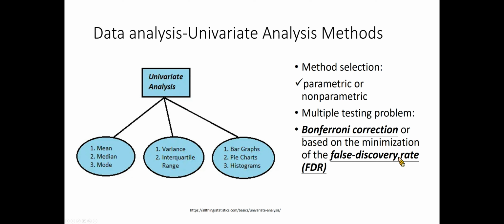Most of these methods have been extensively used for the analysis of gene expression microarray data, where thousands of genes are tested in parallel. In untargeted metabolomic studies, where large numbers of metabolites are simultaneously analyzed, and where it is also expected that more than one or two of these biomarkers will be associated, the use of less strict multiple correction methods such as FDR methods might be more useful.